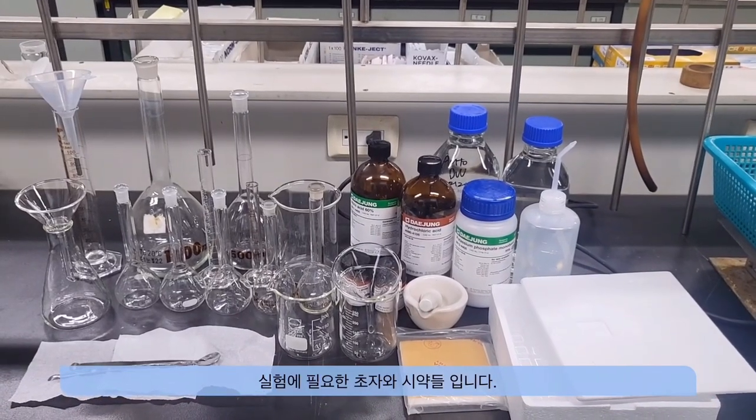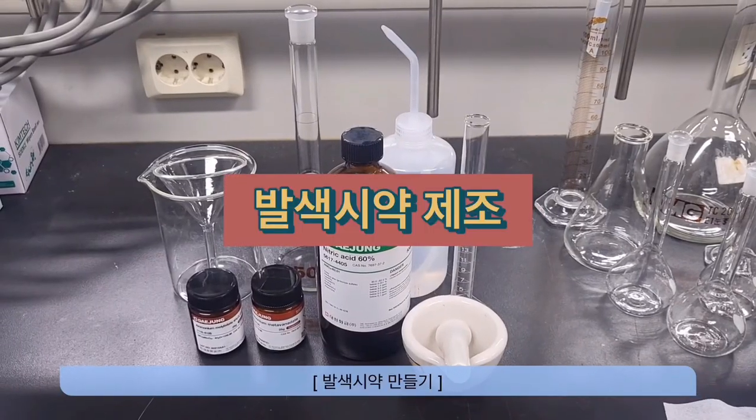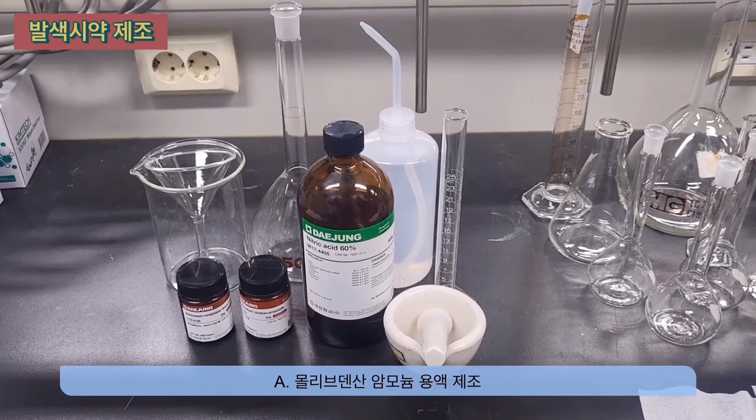Here are the necessary glassware and reagents for the experiment. First, prepare the coloring reagent. Here is the method for preparing ammonium molybdate solution.